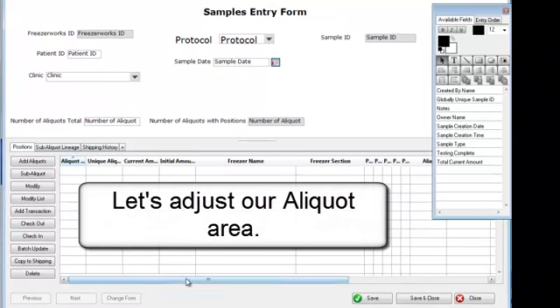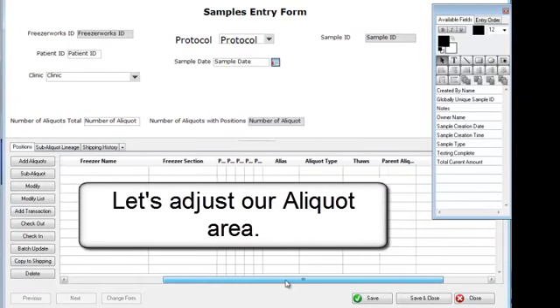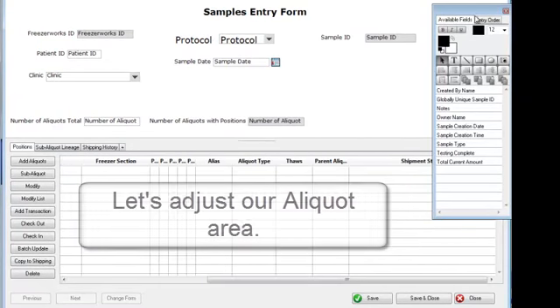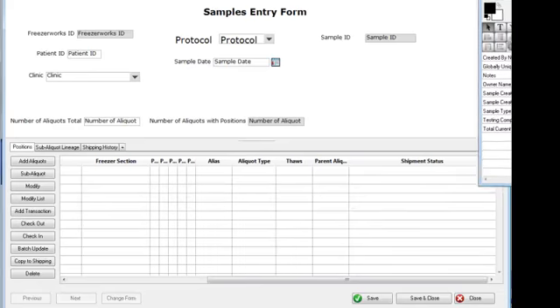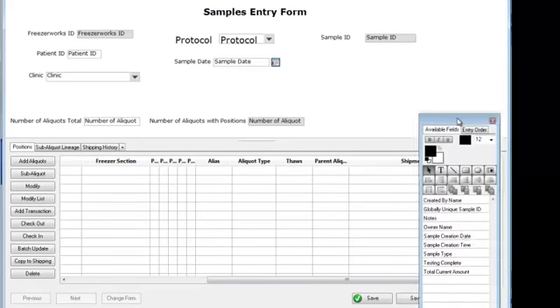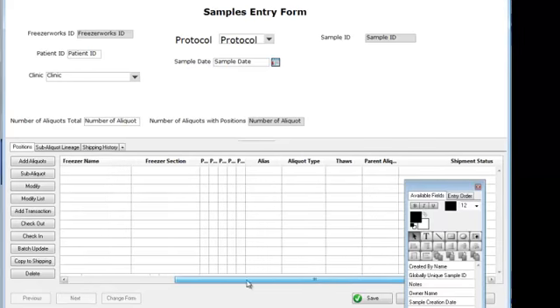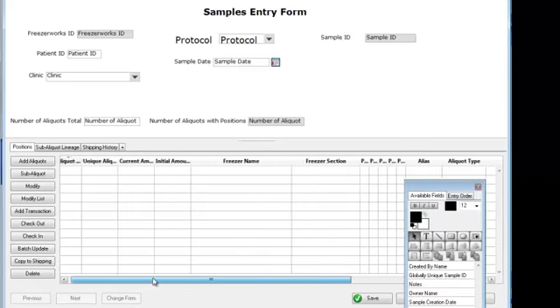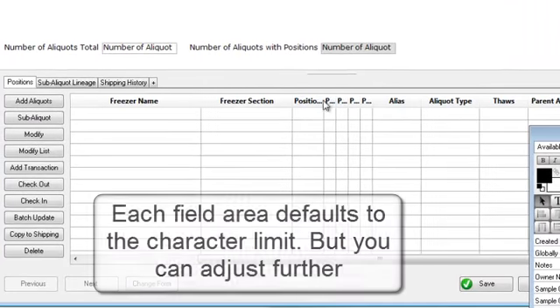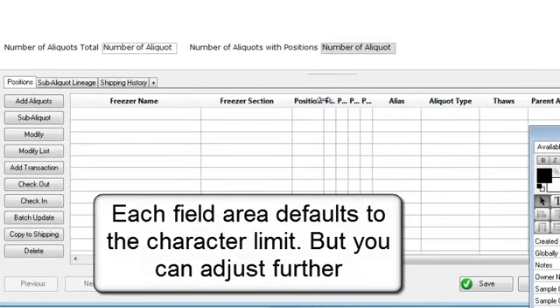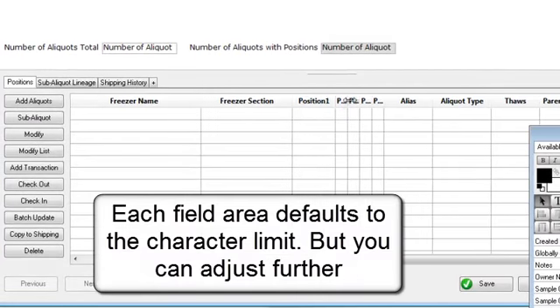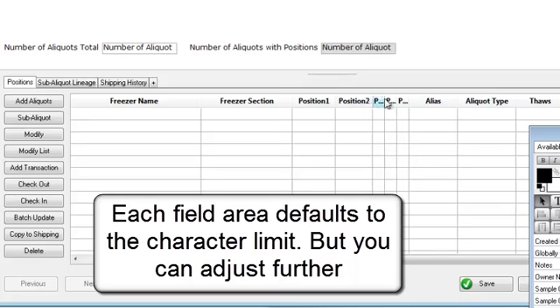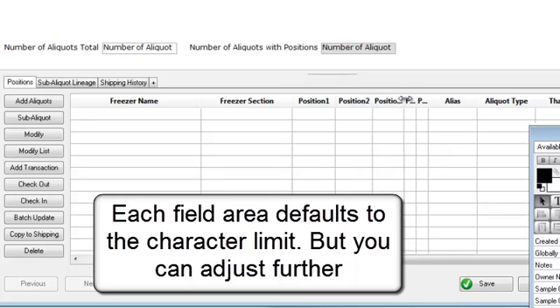Let's adjust our aliquot area. Each field area defaults to the character limit, but you can adjust it further.